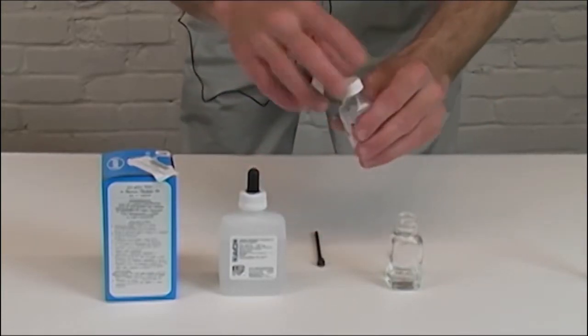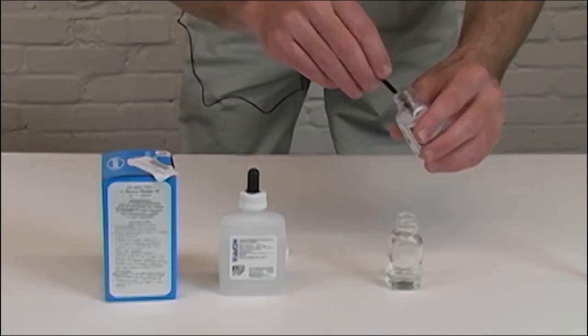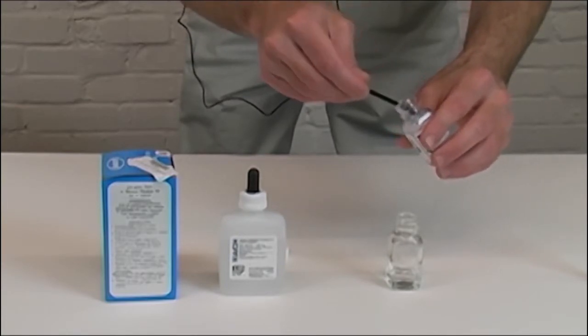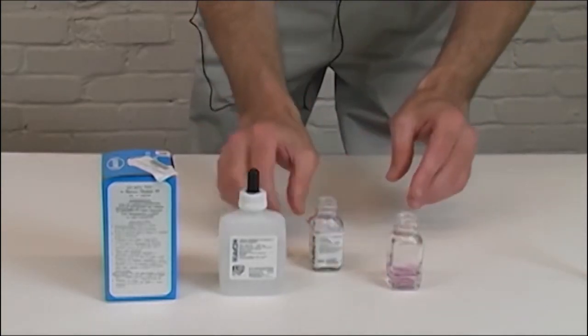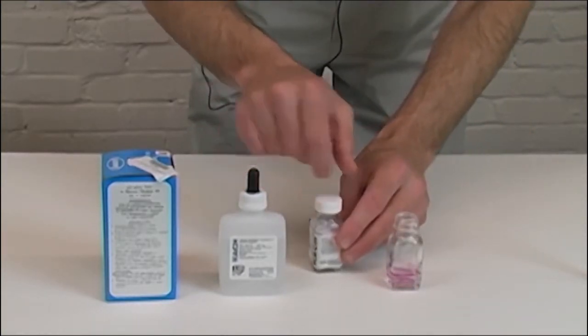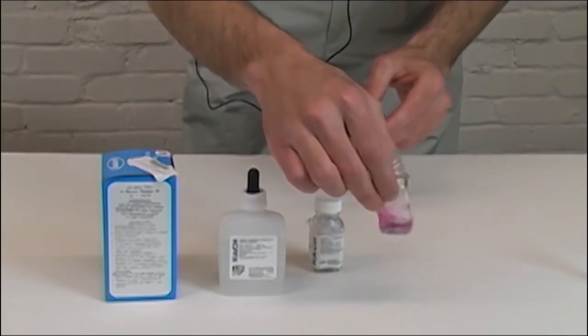Then you will take one measured scoop of the hardness indicator and mix it in your water. Stir it up there, you'll notice it will turn a reddish pink color.